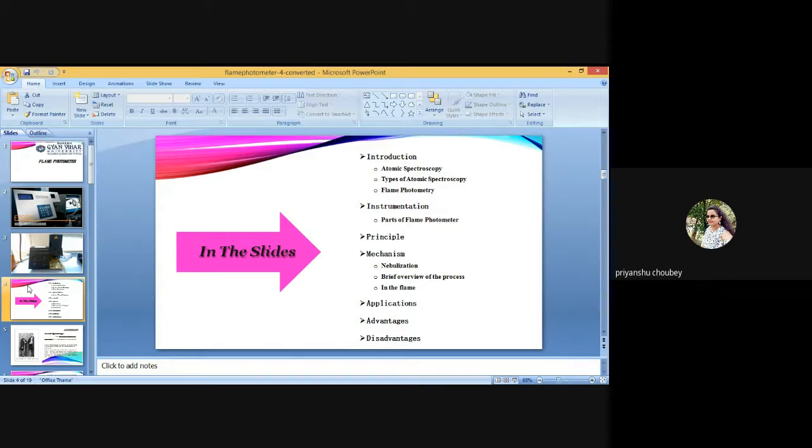Light emitted from the core of the flame just above the inner cone is collected by a reflector and focused by a lens of heat resistant glass through an interchangeable optical filter, an interference type filter, onto a single photo detector. Alternatively, light from the burner passes into a monochromator and radiation leaving the exit slit is focused onto a photo detector.